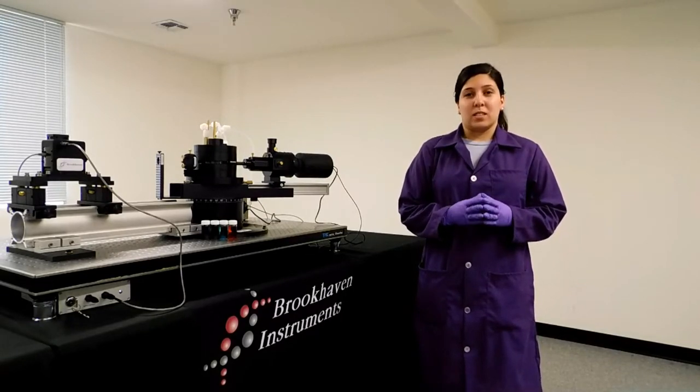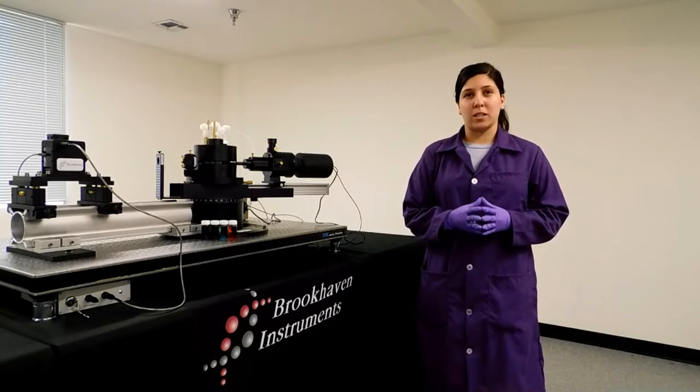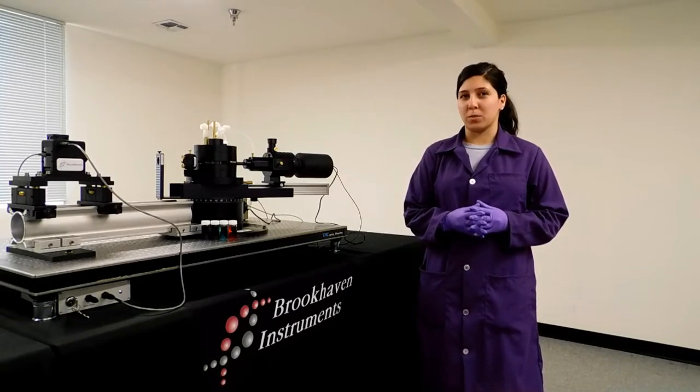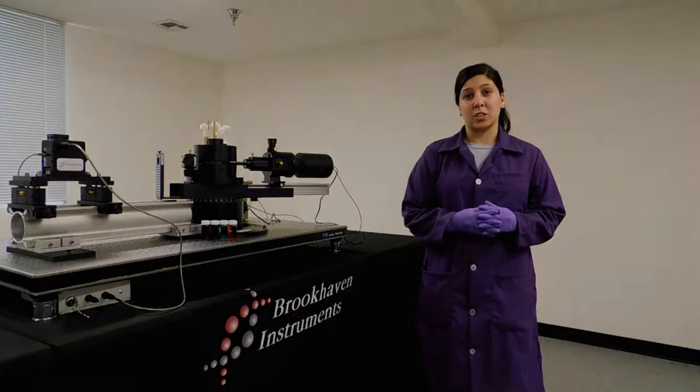The alignment process is very lengthy and requires your full attention. If more time is spent throughout the alignment to make sure each step is performed properly, this will actually prevent you from having to go through the whole process again. So please take your time.